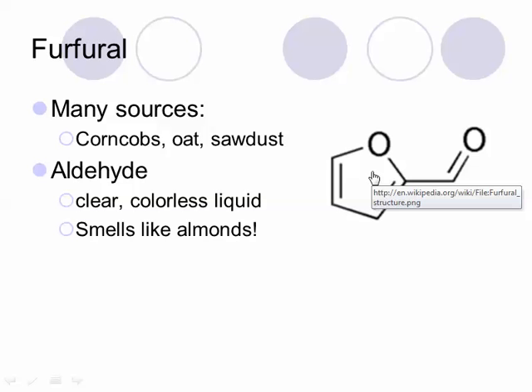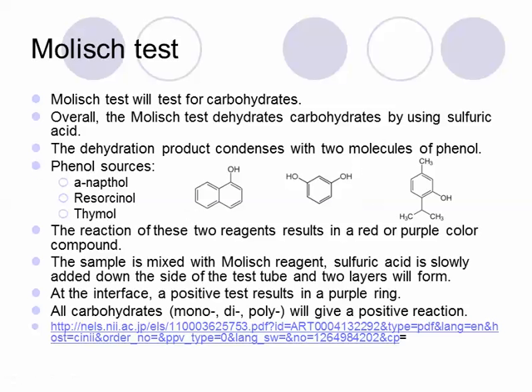There are many sources for furfural. They're listed here on the slide for you. They smell like almonds most of the time. So when you pick up these pure furfural compounds, they do have a nutty odor to them. They smell quite nice actually for an organic.